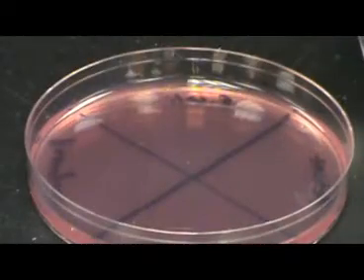Shown here is the simple, straight-line plate inoculation used for the MacConkey agar test.